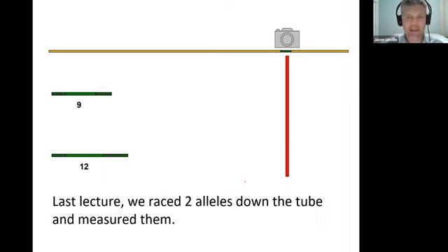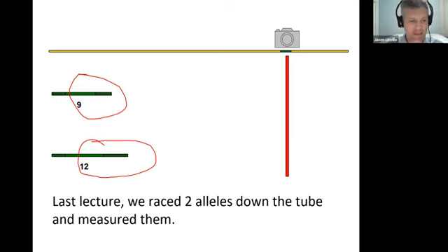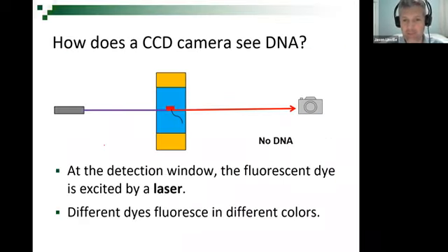And in my DNA, at that location in my genome, I have 2 alleles, one from my father, one from my mother. One of those alleles is a 9 and one of them is a 12 repeat. So when we amplify this DNA, we use the primers, it attaches, it creates like 10 million copies where the allele is 9 repeats long, 10 million copies where the allele is 12 repeats long. And then we take those millions of amplified DNA, prepare them for electrophoresis, run them, and we detect the peaks.